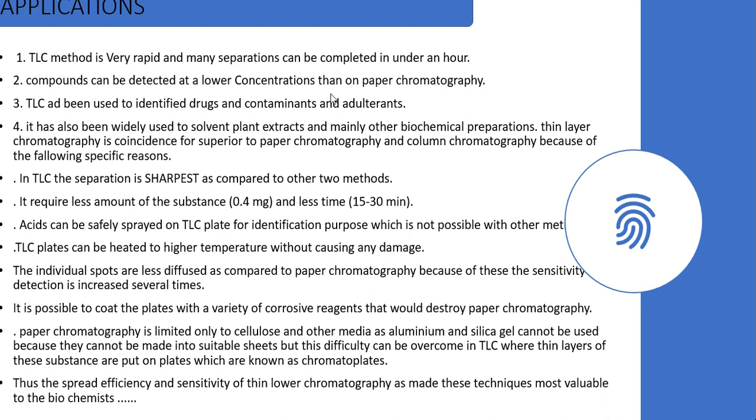TLC can also be used to identify drugs, contaminants and adulterants. It has also been used to analyze plant extracts and many other biochemical preparations.